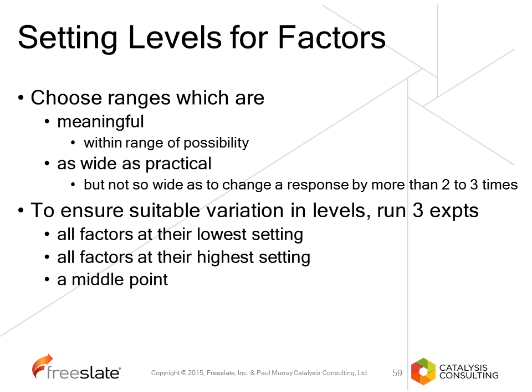When you carry out experimental design and we've chosen our factors and our ranges, there is a neat trick that you can carry out. This is where you pick 3 of the initial set of experiments you carry out. So you carry out the experiment where all or most of the factors are at the lowest setting, and the other experiment where all or most of the factors are at their highest setting, and you carry out one of your 3 midpoints as your first 3 experiments.